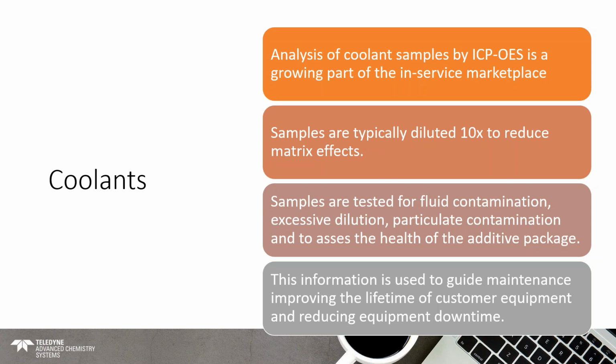Essentially, what they want to use this information for is to do informed maintenance so that they know when something is starting to wear, when a component needs replaced, or when their coolant just needs flushed, and then they can do that at a time which is convenient rather than having a breakdown in the middle of a project.